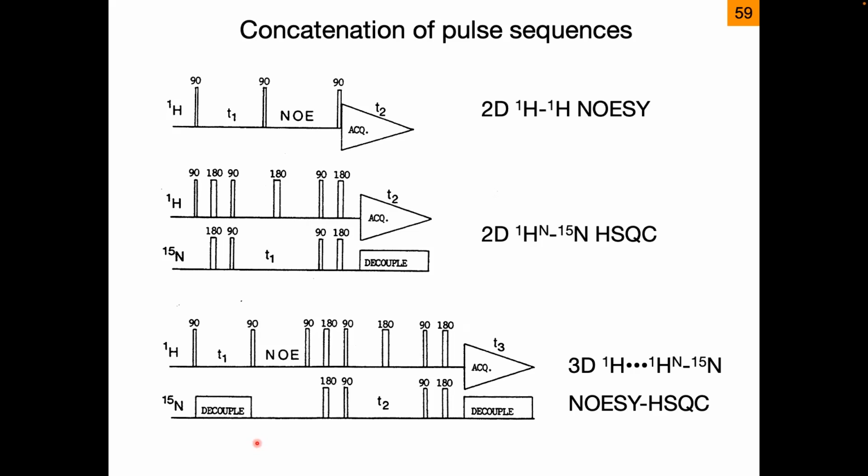And the relaxation rate, or the build-up rate of the NOESY, is again a process that doesn't require energy because the protons flip. So it's at spectral density 0, and therefore it's proportional to tau c, meaning for large proteins, actually, the NOE transfer gets more efficient. So NOE is good for large proteins.